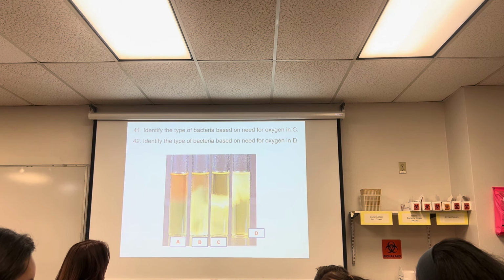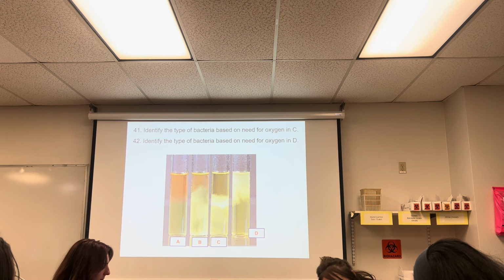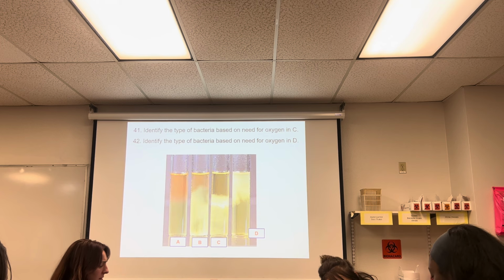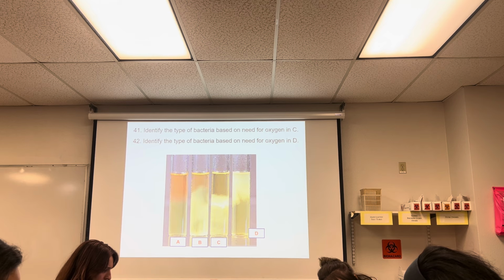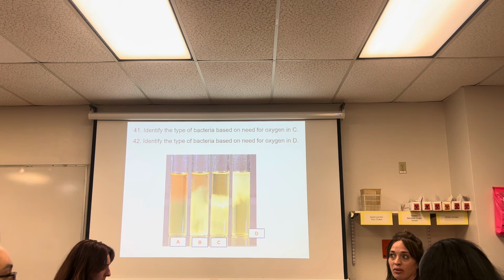That one grows in the middle, Doc, not at the very top, not the very bottom. Okay? So if it grows throughout the tube, but there's more growth at the very top, what is it? It prefers oxygen, but grows with or without it. That's facultatively anaerobic. And if it grows throughout the tube equally, it's an aerotolerant organism. Questions? Wait, so what's the difference between B and C? It's just, is that orange at the top? Yeah, but there's no difference. They're the same growth pattern.